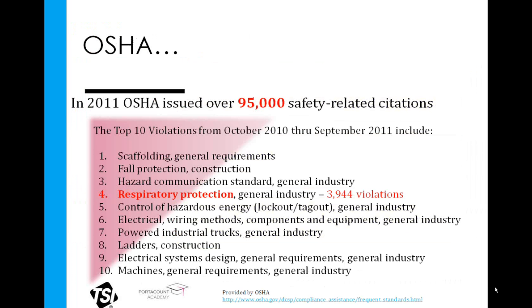In 2010 through 2011, OSHA issued over 95,000 safety-related citations. And coming in at number 4 was respiratory protection, and it's been coming in at number 4 for many years previous. I briefly want to point out that fit testing is but one part of an entire respiratory protection program described by the OSHA standards. However, it is outside of TSI's purview to discuss other aspects of respiratory protection programs, so we're just going to focus on the fit testing aspect.